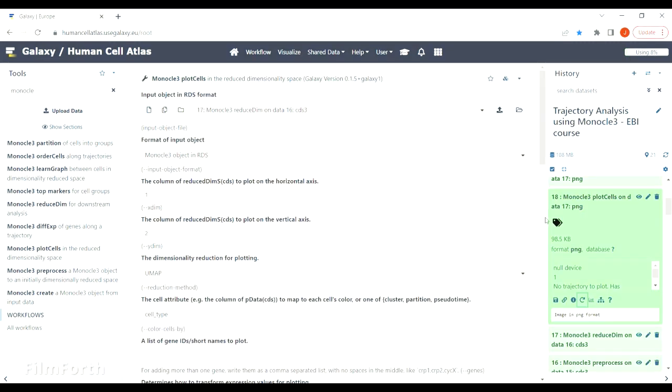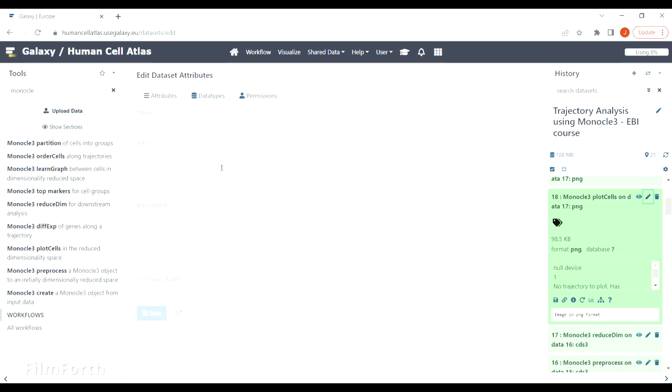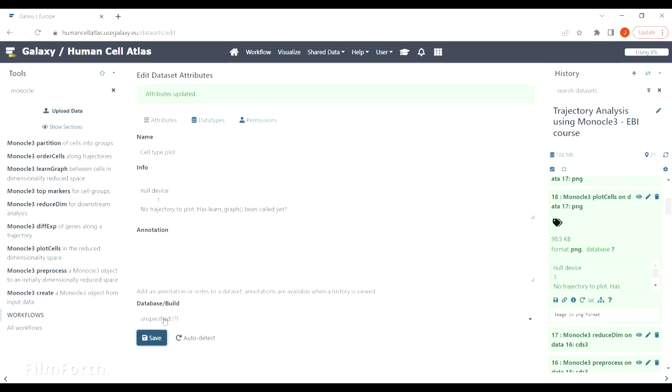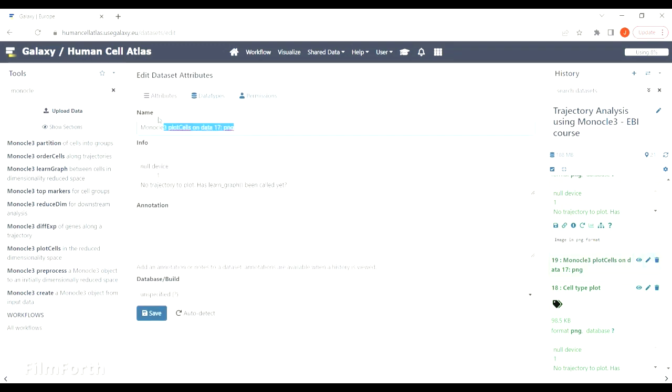This is a cell types plot and you can see that the labels are very small. It would be better to have them next to the plot as a legend. Let's just have a look at all the generated plots and change their names accordingly.